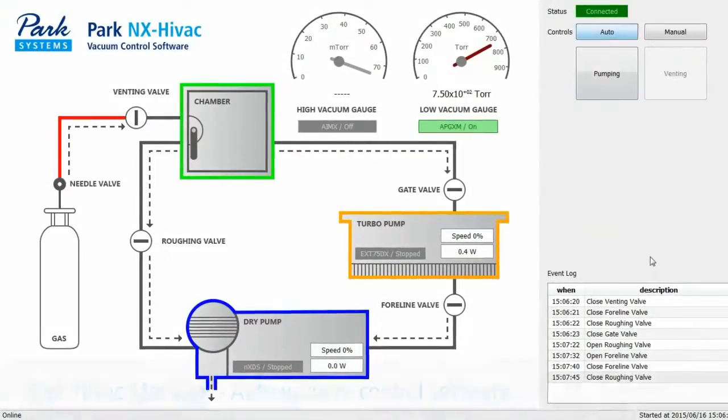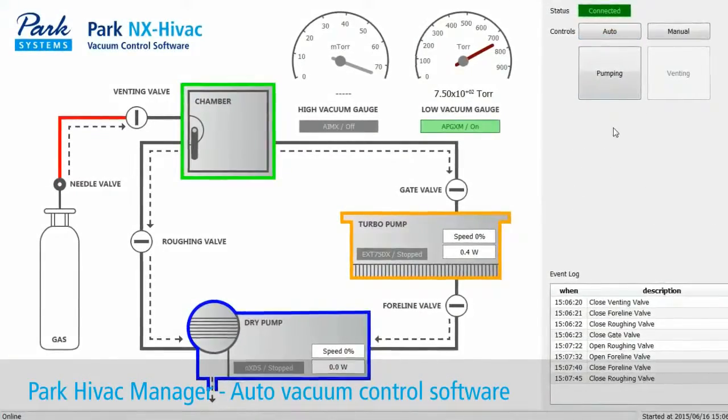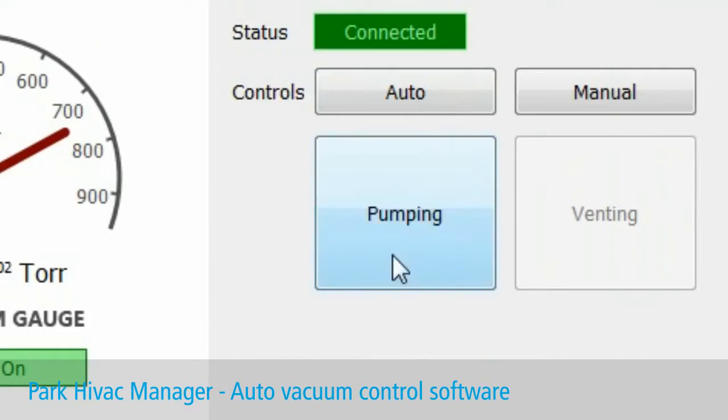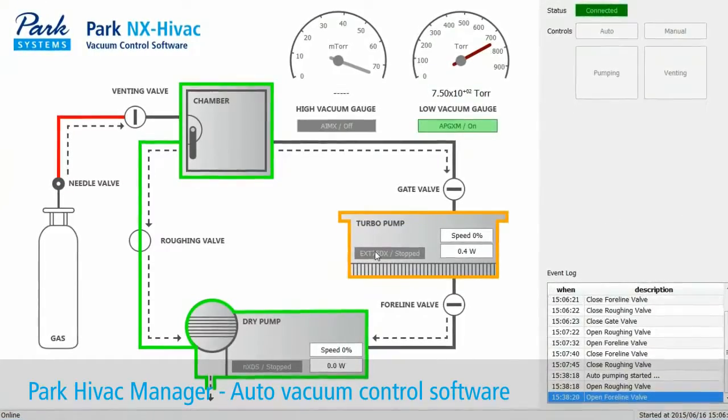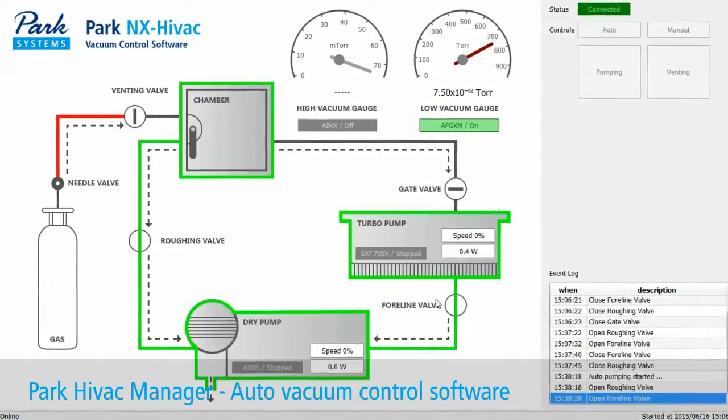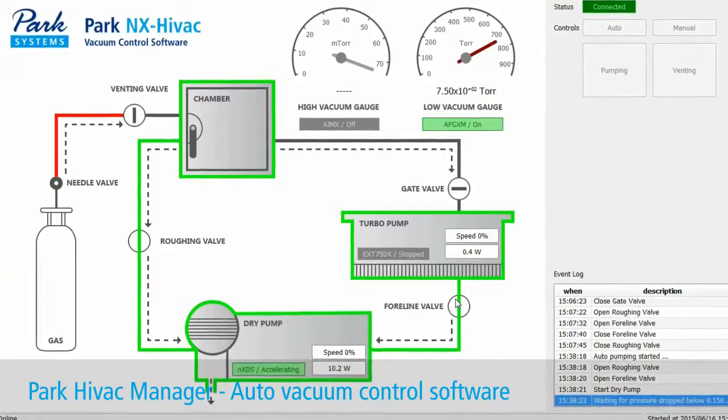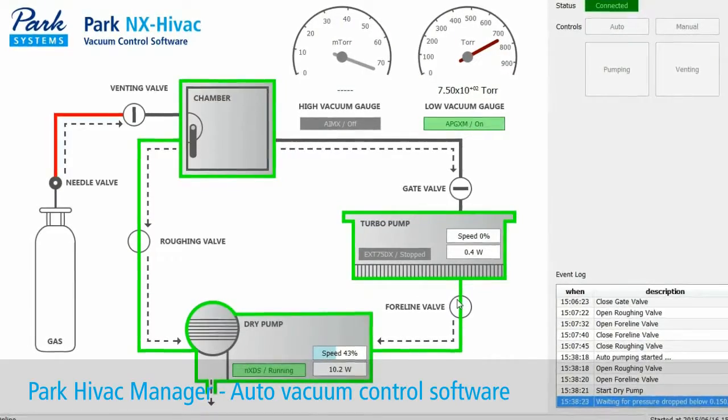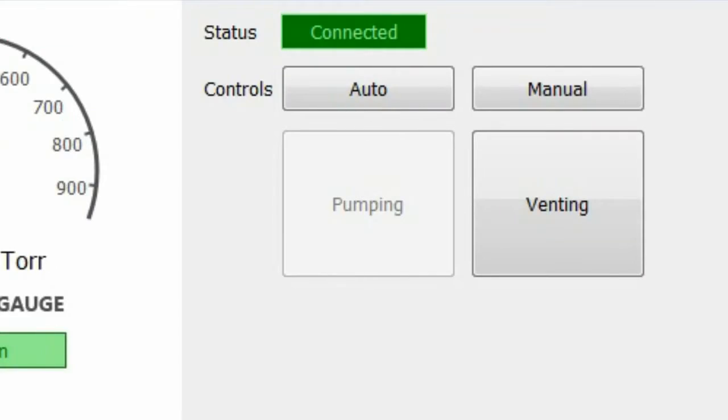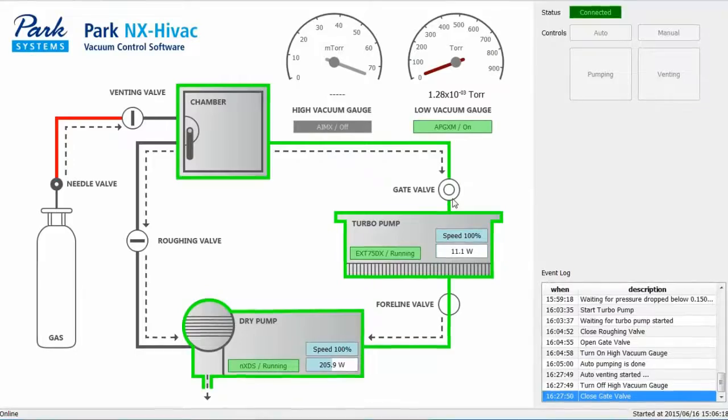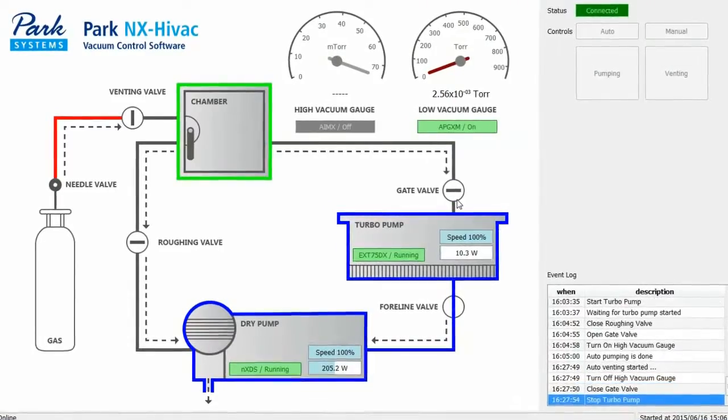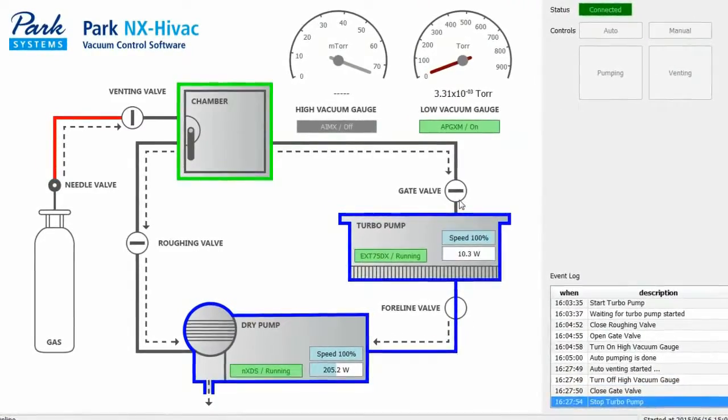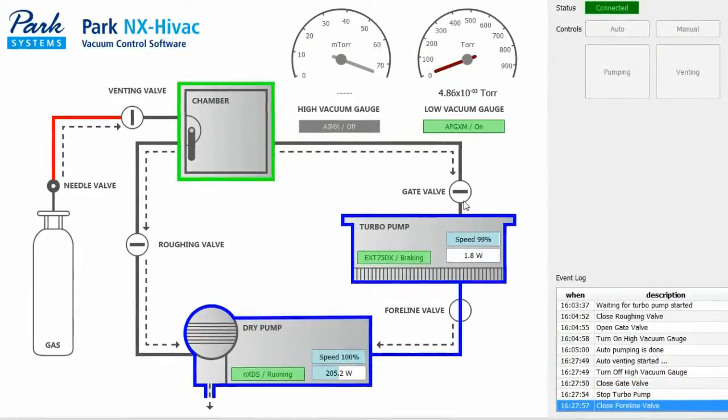our PARC-NX HIVAC manager software. This program enables single-click, automatic high vacuum control that uses intuitive color schemes and other interface elements to instantly alert a user visually what phase of vacuum preparation the system is currently in.